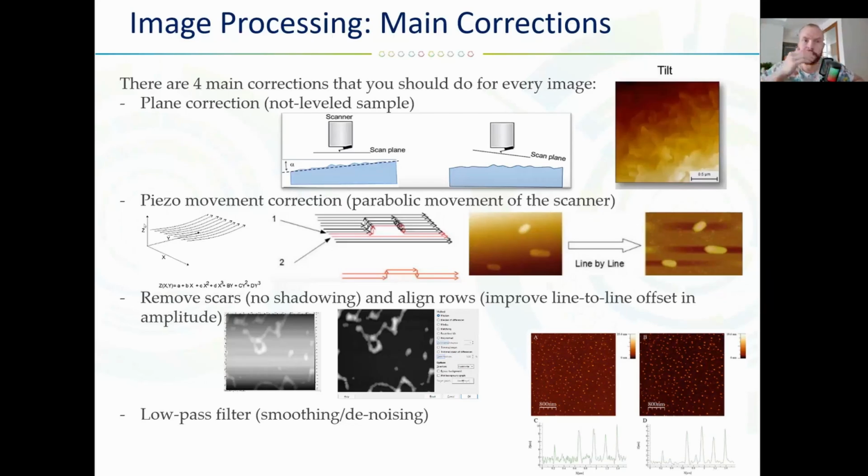Low frequency noise is very hard to avoid, and usually you avoid it only when you install the whole setup, the whole microscope, on special tables. And normally with low frequency noise, you cannot do anything except improve insulation, noise and vibration insulation.